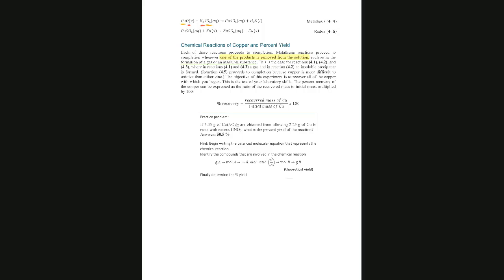And what happens in this fourth reaction? We have the black, we said that this is black. When it says S, try to be familiar with what is in parentheses because they are telling you the phase of that substance. So they are giving you an indication if you're going to have a solid, if you're going to have a solution. In this case, you have the solid that you wash several times, copper oxide.